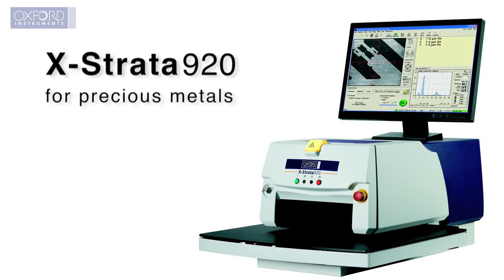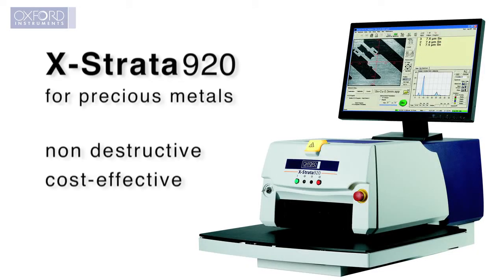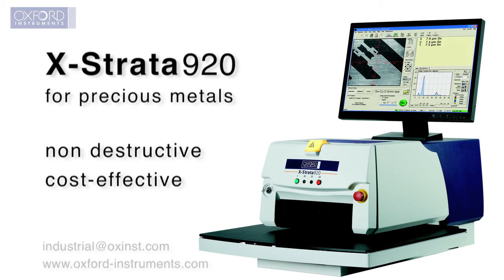The X-Strata 920 provides non-destructive, rapid, accurate results for material identification of precious metals and jewelry. Day after day, with no sample preparation.